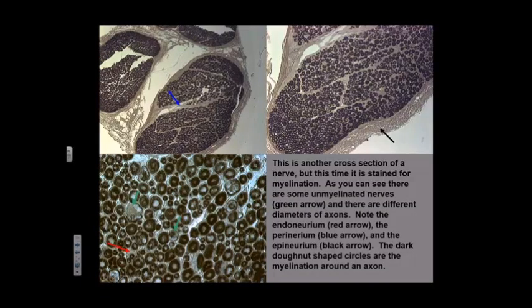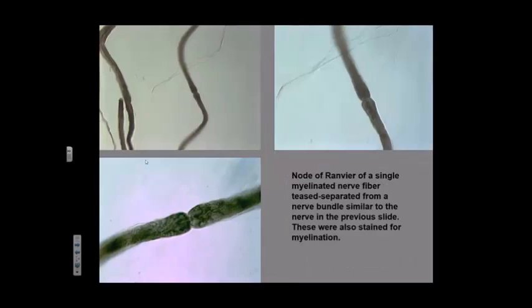So, you've seen this already, and we were talking about the degree of myelinization. This slide is actually stained for myelin, and the black or dark brown areas are really the myelinization. So epineurium, perineurium, and in between these axons, not the myelin, but in between, is the endoneurium.